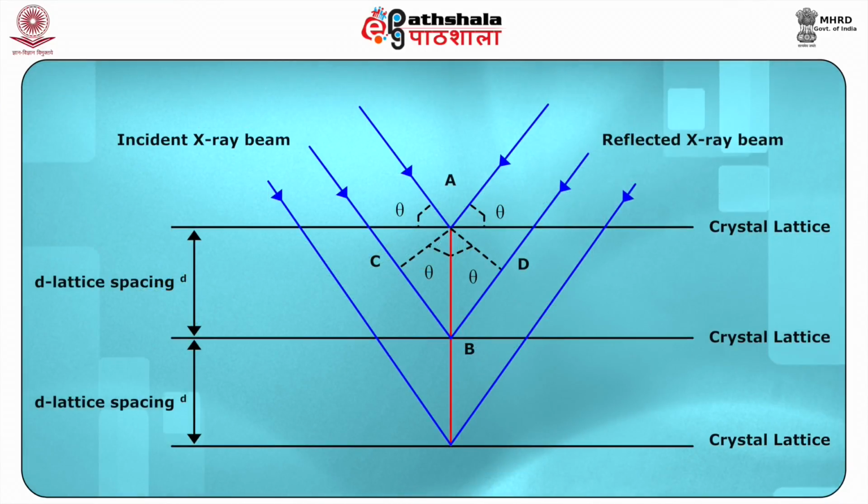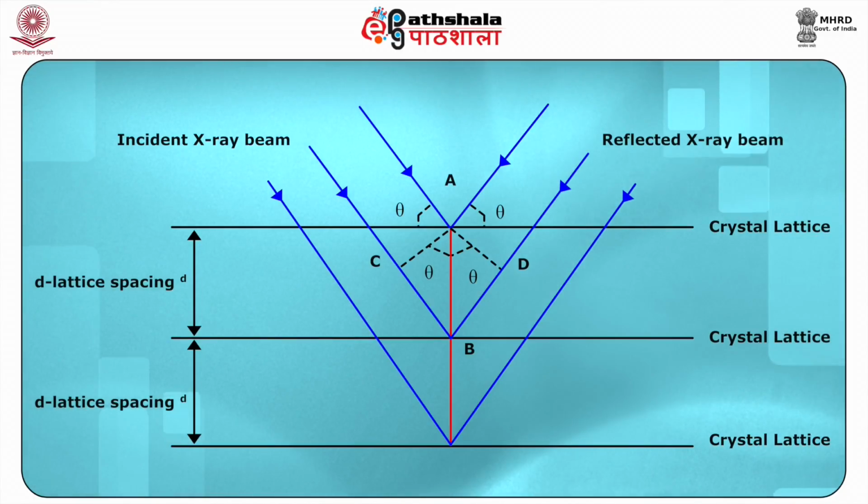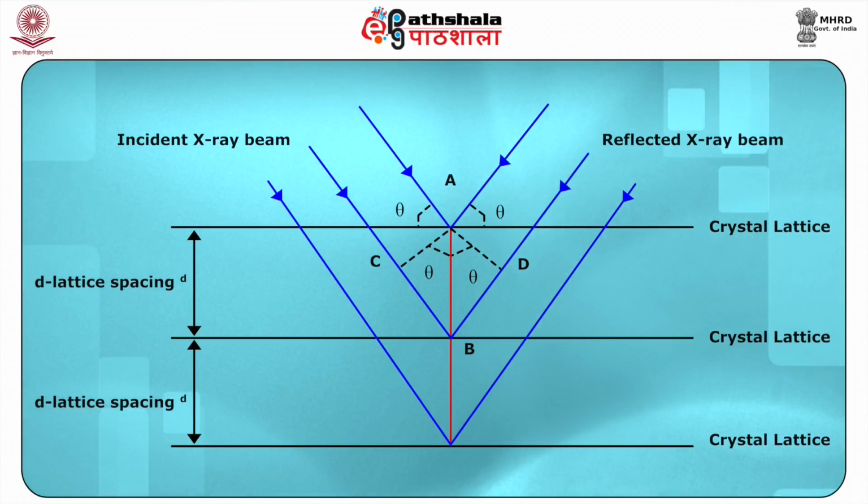The absorbing atoms get excited and emit X-rays of characteristic wavelength of the elements present in the absorbing material, and this process is known as fluorescence. As the wavelength of the fluorescence is characteristic of excited atoms of particular elements, measuring this wavelength would enable one to identify the fluorescing element. A greater amount of an element will yield greater intensity and a small amount will show less intensity for the sample, because the intensity of fluorescence depends on how much of the element is present.